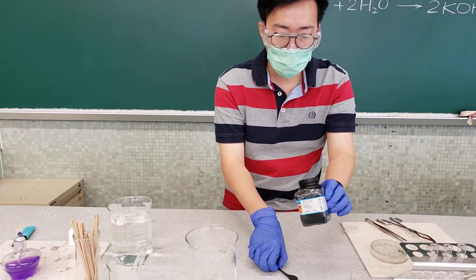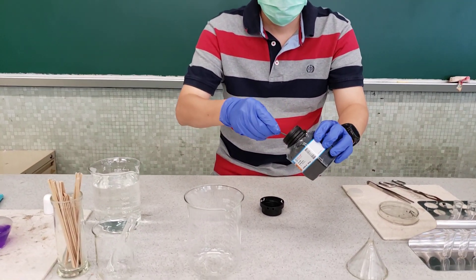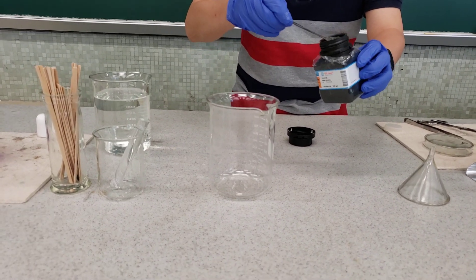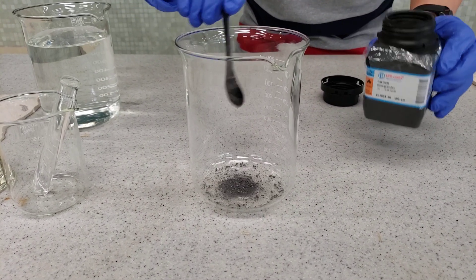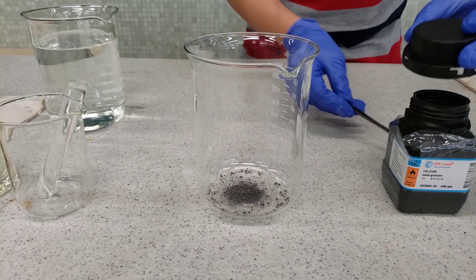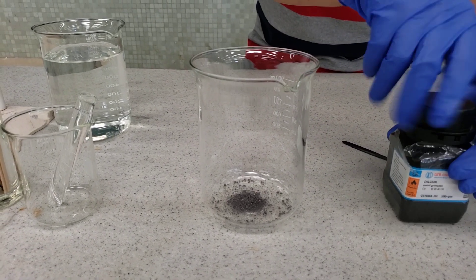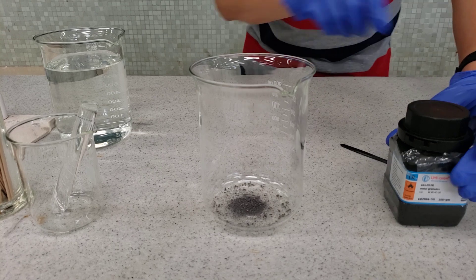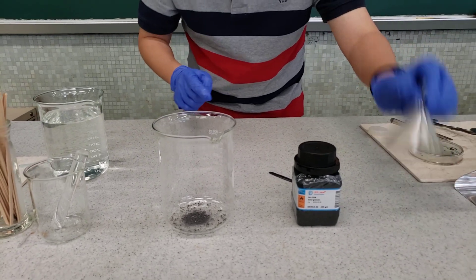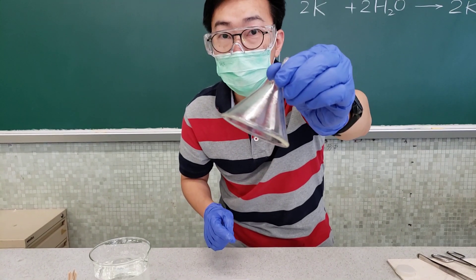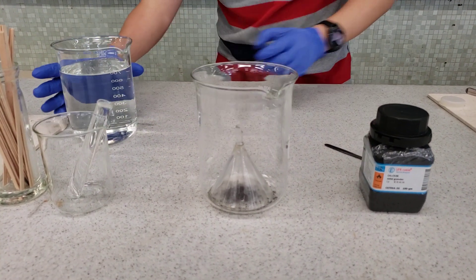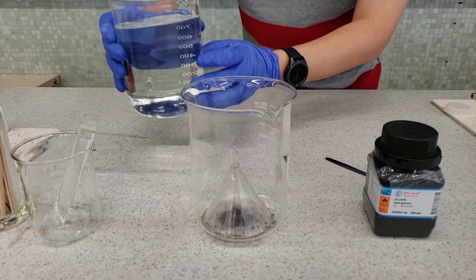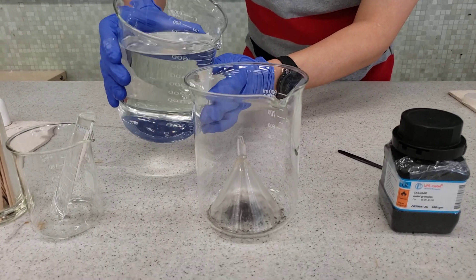So I'm going to put some calcium granules into this beaker and then I am to study the reaction between calcium and water but before that I will use this, a funnel. Put it like this. Now I am going to transfer water into this beaker.